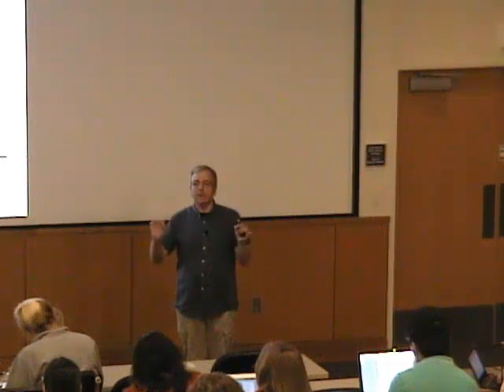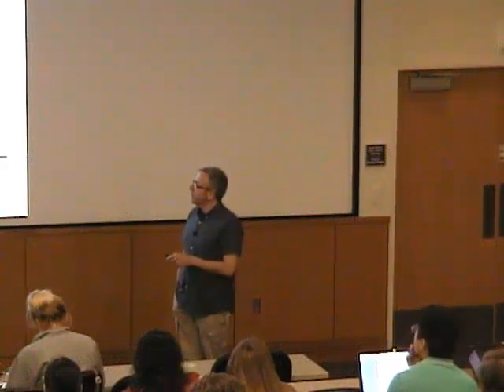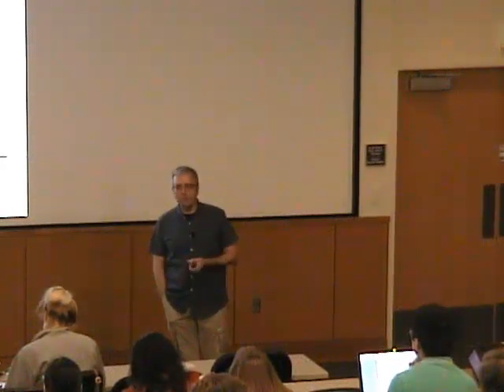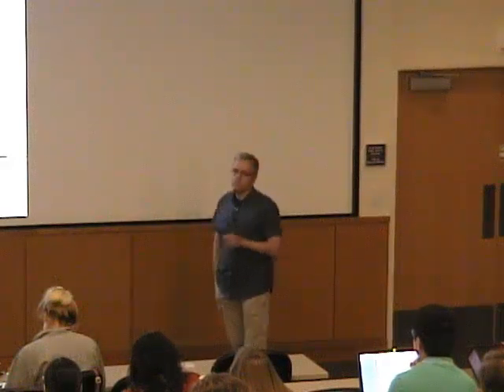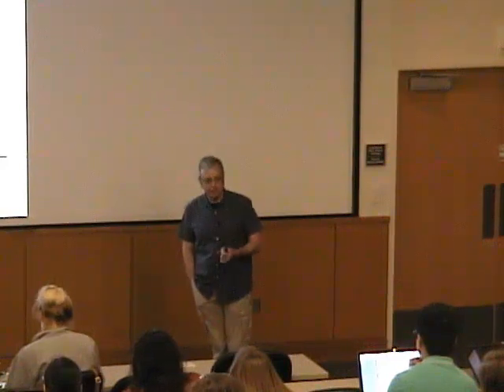We take one reference, and the position of all the other waves in the system, all the other reflections, all the other contributions of atoms, whatever we add here, are always the same. And that is why we used to represent waves by these simple vectors. And these vectors are called structure factors, and that's our Fourier representation of the structure. And it's a wave.